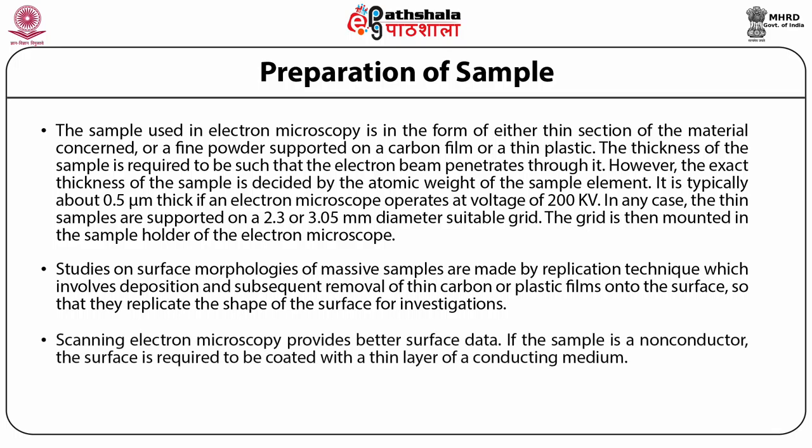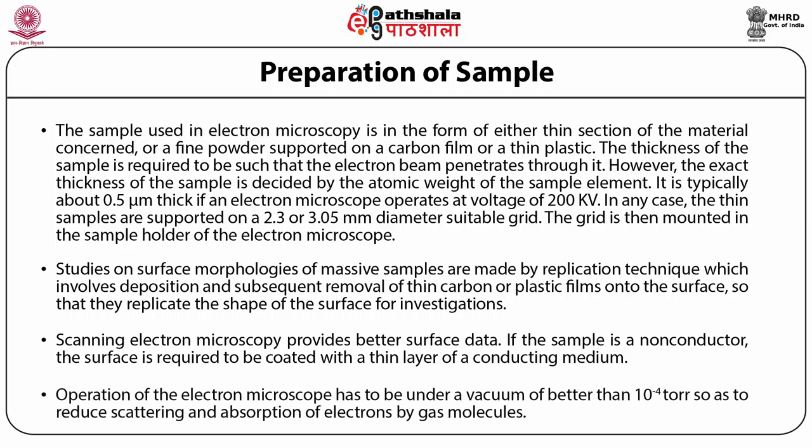Scanning electron microscopy provides better surface data. If the sample is a non-conductor, the surface is required to be coated with a thin layer of a conducting medium. Operation of the electron microscope has to be under a vacuum of better than 10 raised to the power minus 4 torr so as to reduce scattering and absorption of electrons by gas molecules.